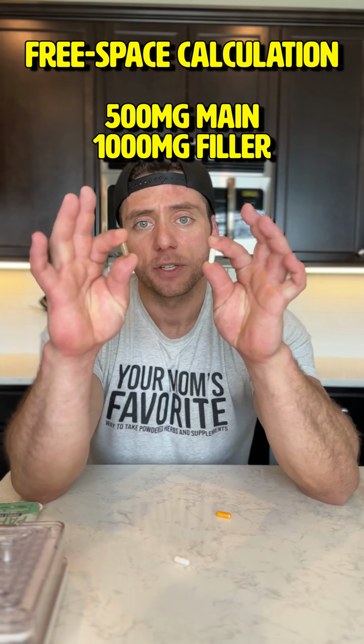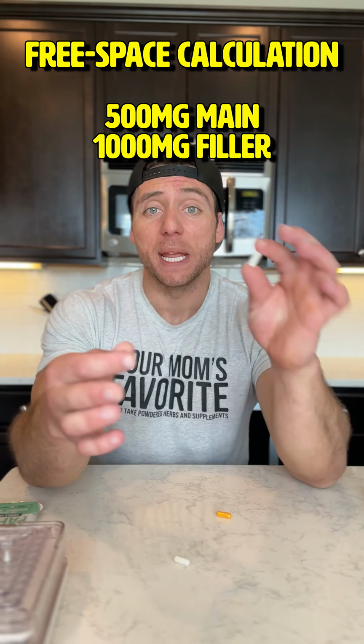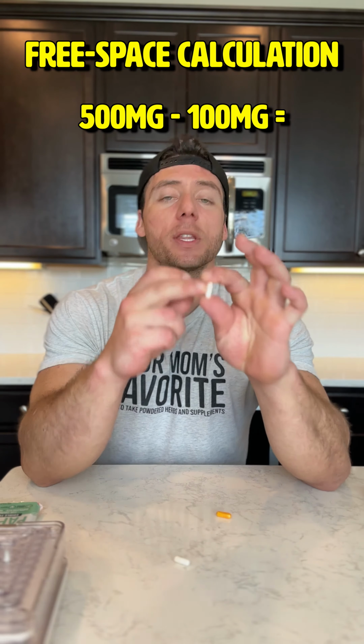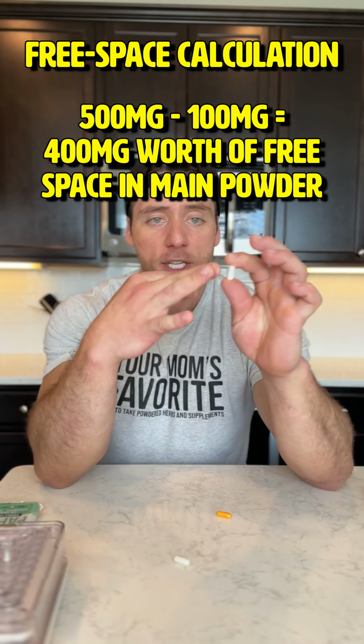You fill one capsule with as much main substance as you can, and you weigh that out and find out how much that was. Then you do the same thing with the filler substance. Let's say that this held 500 milligrams of our main substance and 1,000 milligrams of our filler substance. Because we want 100 milligrams of our main substance, we're going to minus the 100 milligrams from the 500 that this could hold. Okay, so that gives us 400 milligrams of potential free space held by this main substance.